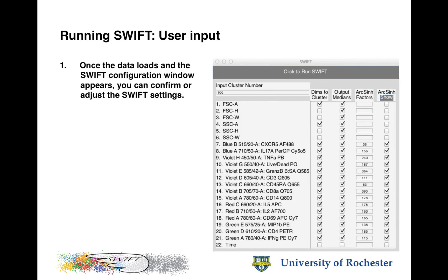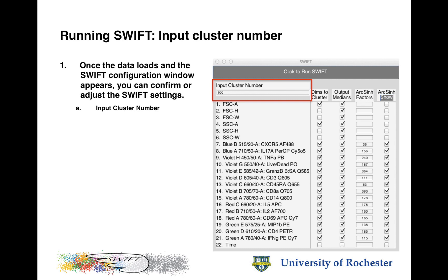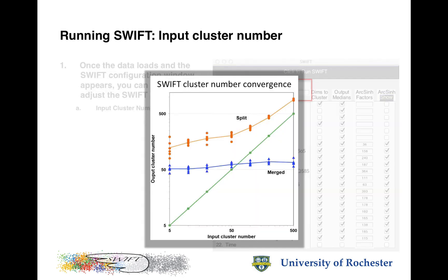Then the user input window appears, which allows you to customize the parameters that Swift uses to analyze the data. First of all, the input cluster number — this is the number of Gaussian distributions that will be used by Swift in the first step. As explained earlier, this number will be substantially modified by the splitting and merging steps, but it is useful if this number is a reasonable approximation of the expected final number. In this case, a number of 100 is suggested. If you think there will be more than 500 clusters in the final analysis, you might want to start with 200 or 300. This is not a critical number because of Swift's ability to self-normalize, as shown in this diagram.